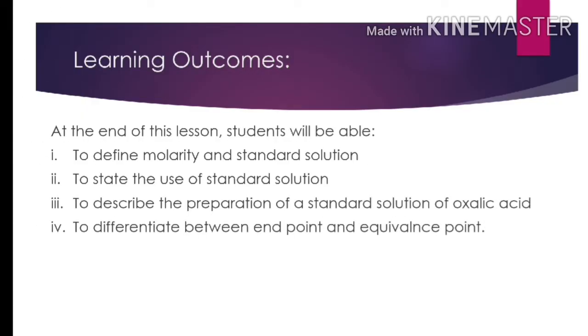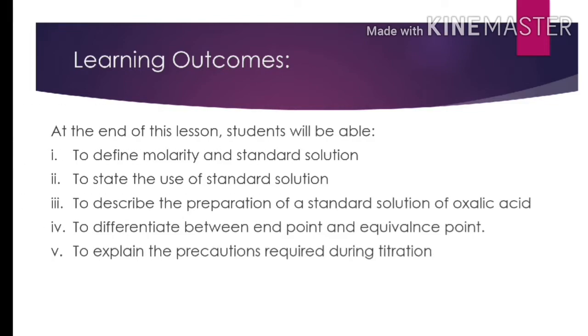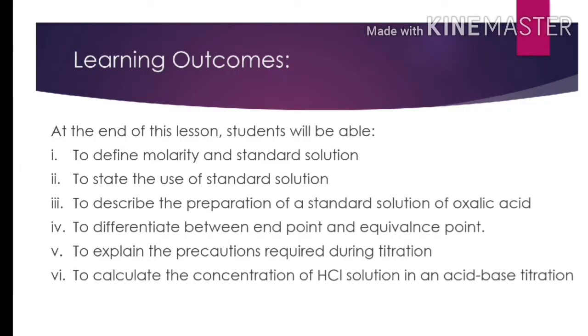Number 4, to differentiate between endpoint and equivalence point. Number 5, to explain the precautions required during titration. And number 6, to calculate the concentration of hydrochloric solution in an acid-base titration.